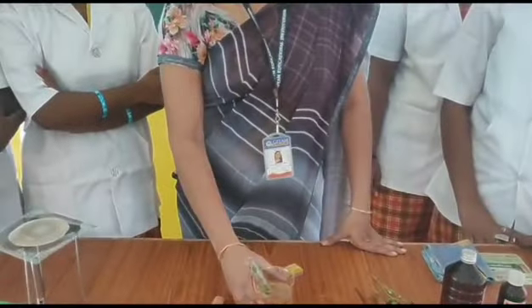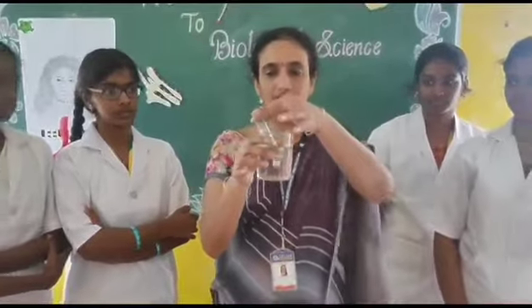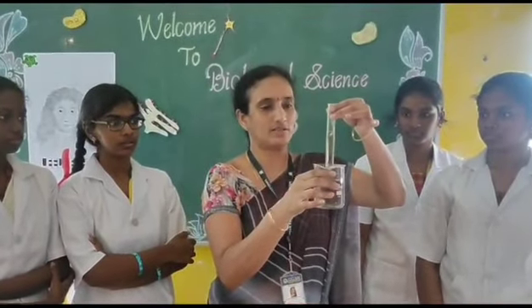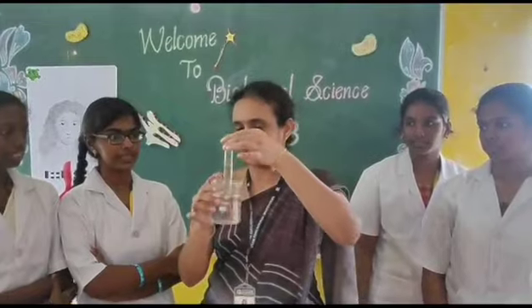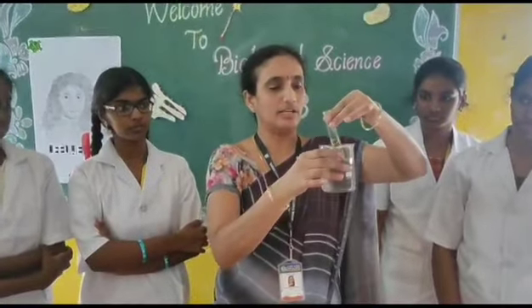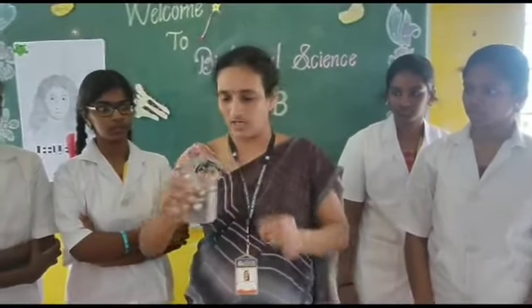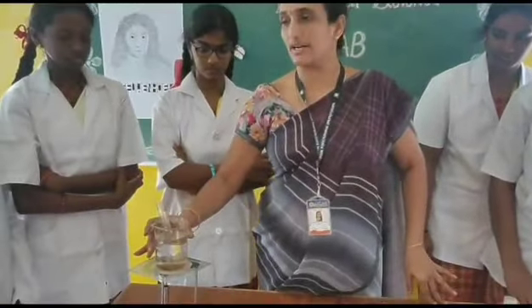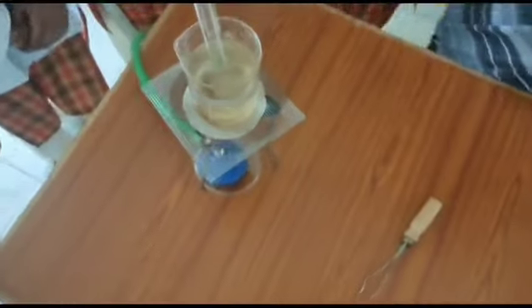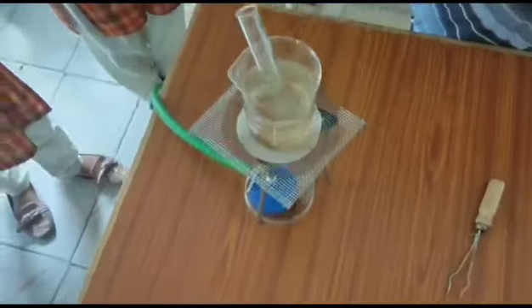For the procedure, we take a beaker containing water and a test tube into which we pour methylated spirit. We place this test tube in the beaker containing water, and place it on a tripod stand. With the help of the Bunsen burner, we boil the leaf.